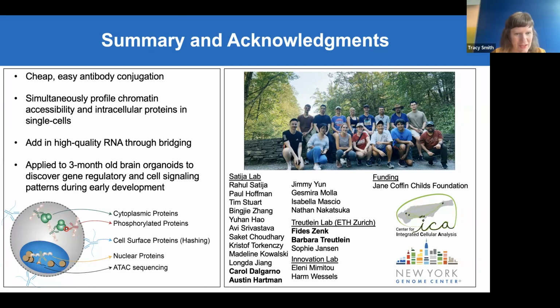Which CITE-seq antibody platforms have you used? For example, 5'? I haven't used 5' CITE-seq antibodies, but we have done a few experiments where we included other CITE-seq antibodies, or antibodies that are compatible with CITE-seq.